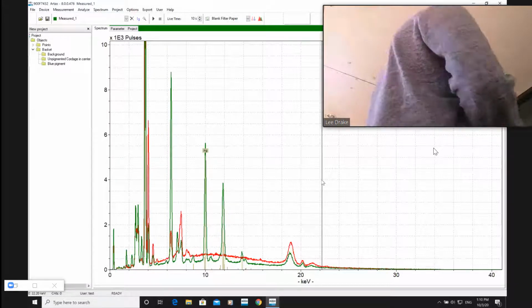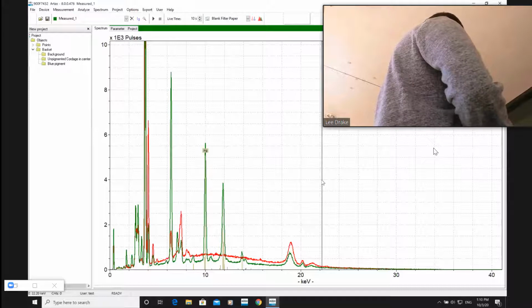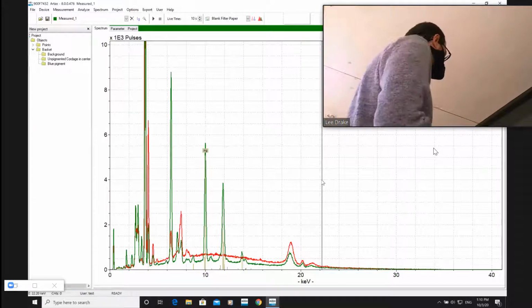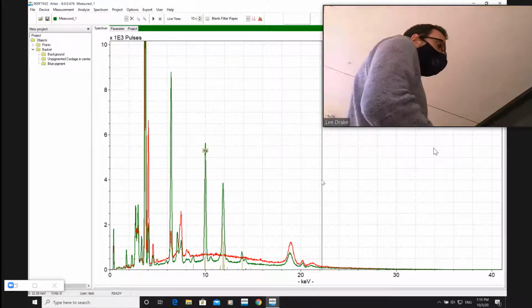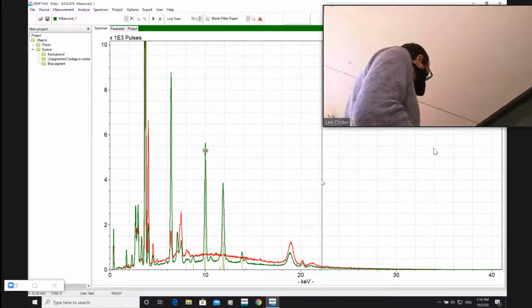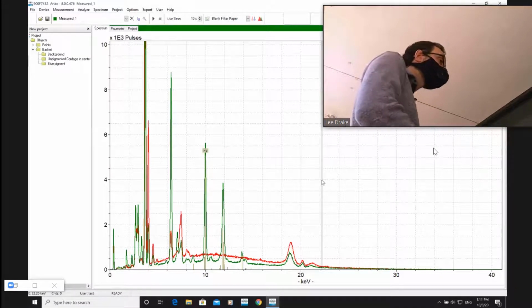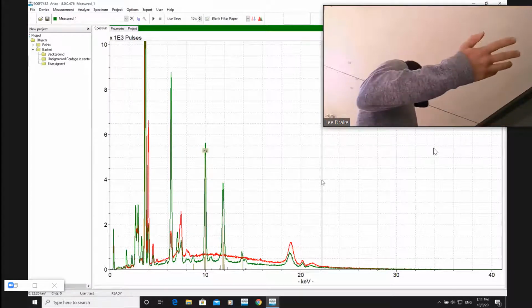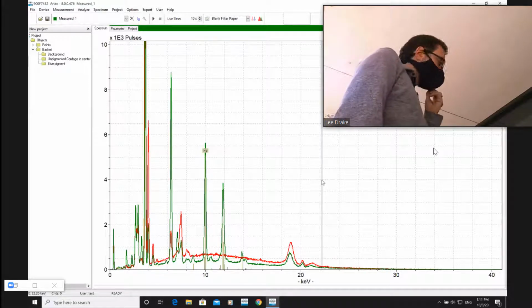As far as handling, back to that question, safe handling of objects like this, gloves sufficient, we're not off-gassing, we're not aerosols. I wouldn't be too worried about any of that. Just the powder. Okay. But that doesn't mean it couldn't be aerosolized if there was a big disruption or you dropped it or something. But I wouldn't be too worried about it. I wouldn't let my kid play with it, but that was true anyway. That's not going to happen. Yeah. Question.